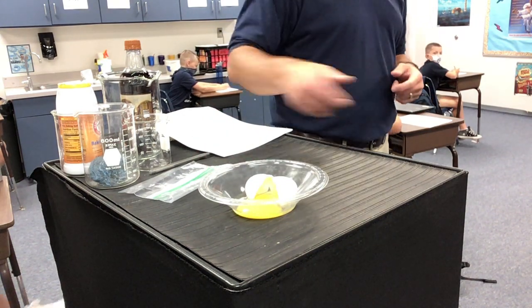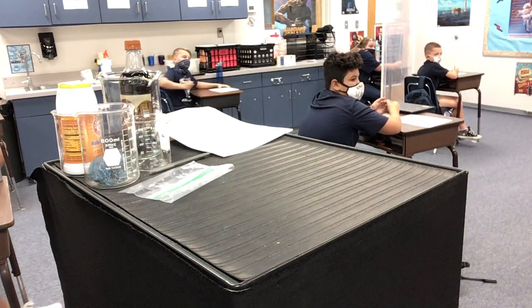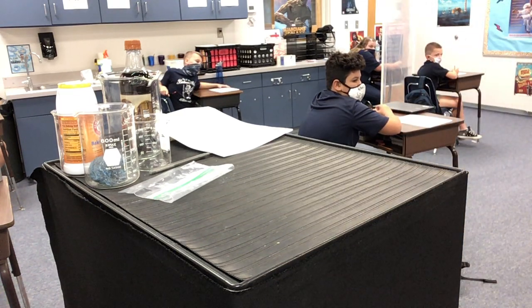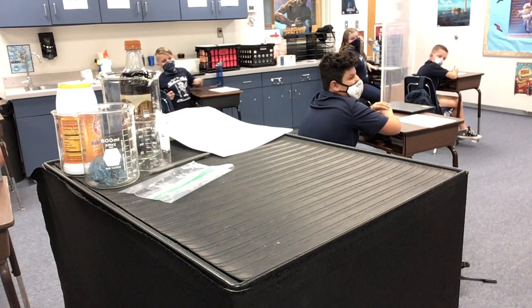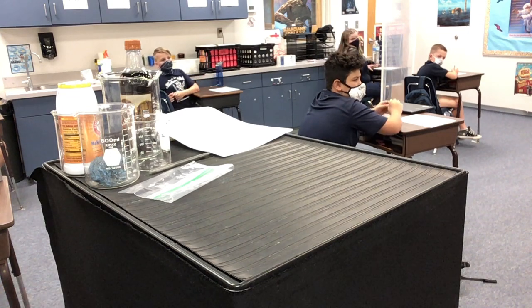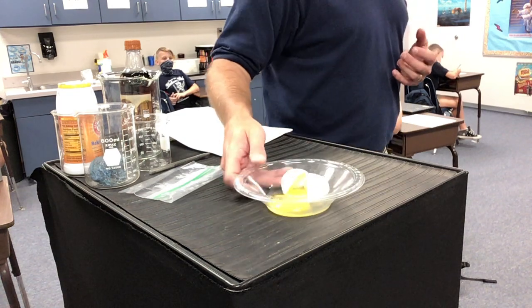The temperature change. Here you go. Feel it. Nope, on the bottom. Put your hand on the bottom. Okay. Is it getting hotter or colder? Yeah, it's cold because it was in the refrigerator, but is the temperature changing? Is it going hot or cold? No. Okay, so William says no, it is not changing temperature.